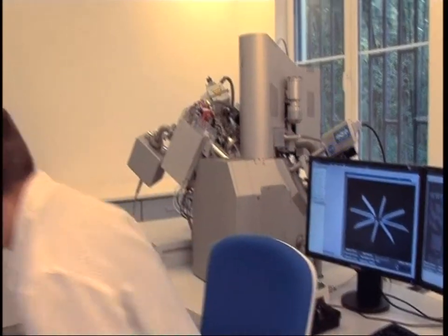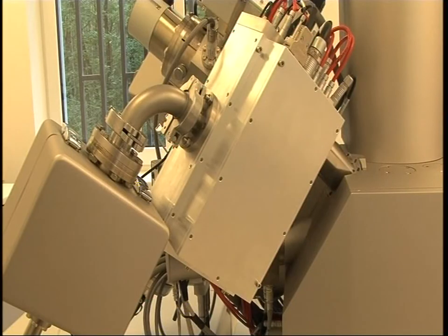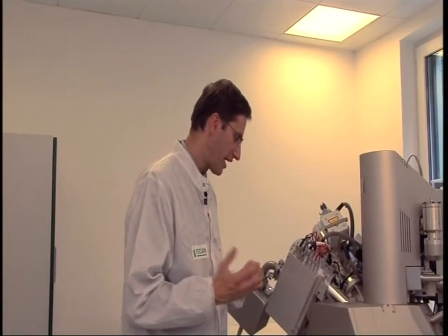It is a time-of-flight mass spectrometer, the so-called TOF. We can see it here. It is a very compact, small device. While in standard cases, such a mass spectrometer requires a one-meter-long device with a special source of ions, which is both very complex and expensive.